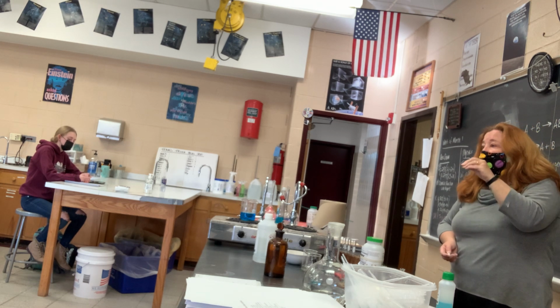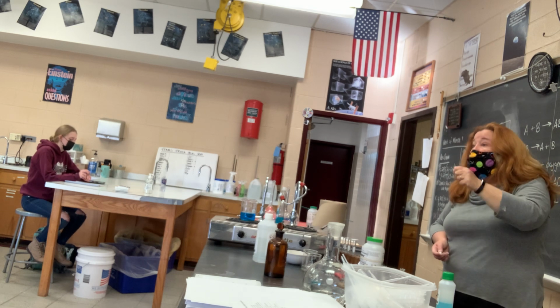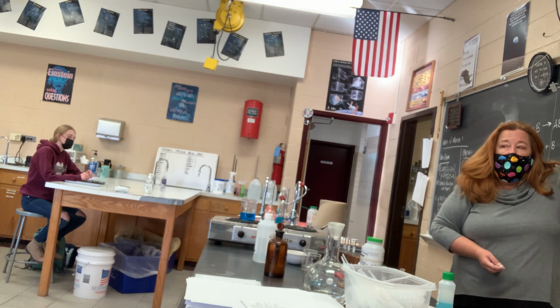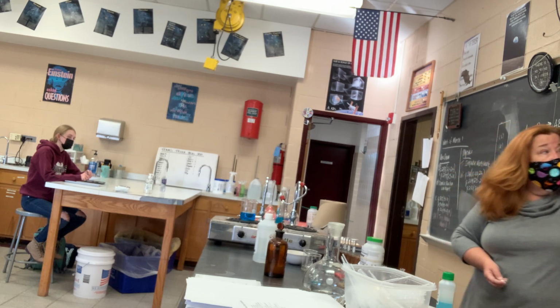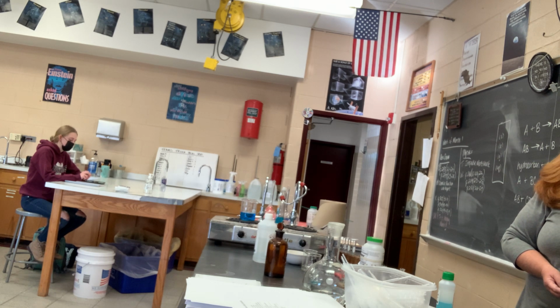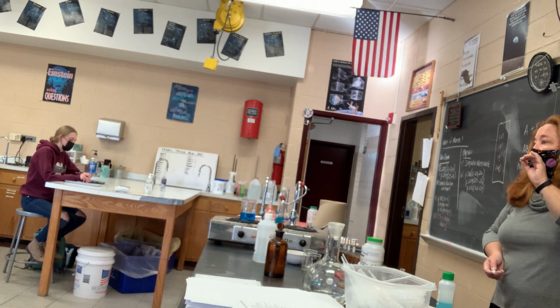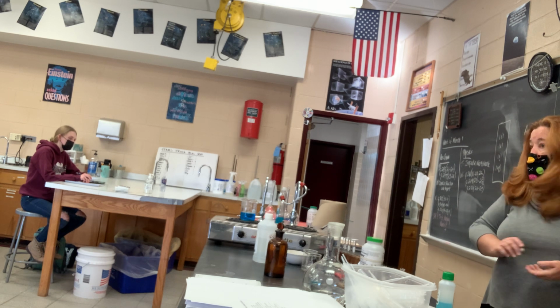So I was trapping hydrogen in the test tube, and then we lit it on fire. See if you can come up with the second reaction that happened during that part. I trapped hydrogen gas in the test tube and then lit it on fire. So see if you can figure out what the second reaction was that happened during that part, and include that as well. And if you get it right, I'll give you some bonus points.